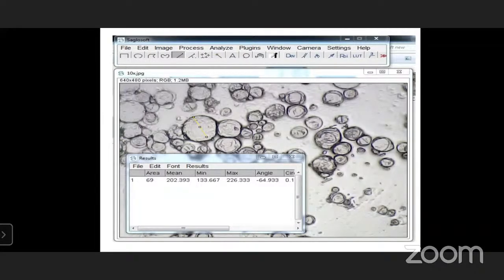एंड कस्टमर किंवा एंड युजर किंवा रिसर्चरचा एक प्रॉब्लेम काय असतो की मायक्रोस्कोप जेव्हा सेट करता येतो किंवा वापरताना सेट करायचा असतो तो म्हणजे डाऊनवर्ड टू अपवर्ड करायचा असतो, नॉट फ्रॉम अपवर्ड टू डाऊनवर्ड. डाऊनवर्ड म्हणजे काय, इल्युमिनेशन पासून कंडेन्सर नंतर त्याच्यानंतर फिल्टर्स नंतर स्टेज नंतर आयपीस नोजपीस आणि नोजपीस नंतर ऑब्जेक्टिव्ह पीस, त्याच्यानंतर मग आयपीस ऍडजस्ट करते कोर्स अँड फाईन. ओके, पण प्रॉब्लेम काय आहे की कधी कधी कस्टमर मधनच ऍडजस्टमेंट करतात फ्रॉम कंडेन्सर. त्यामुळे काय होते की डार्क फील्ड हे प्रॉपर मिळेल त्याची गॅरंटी नसते.